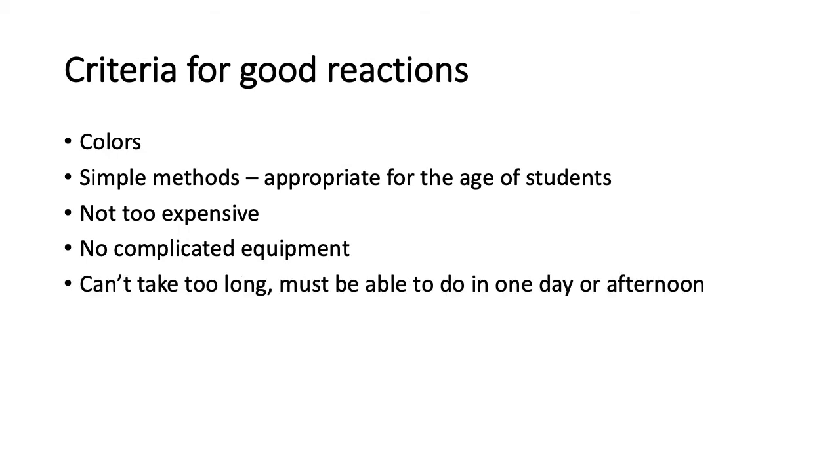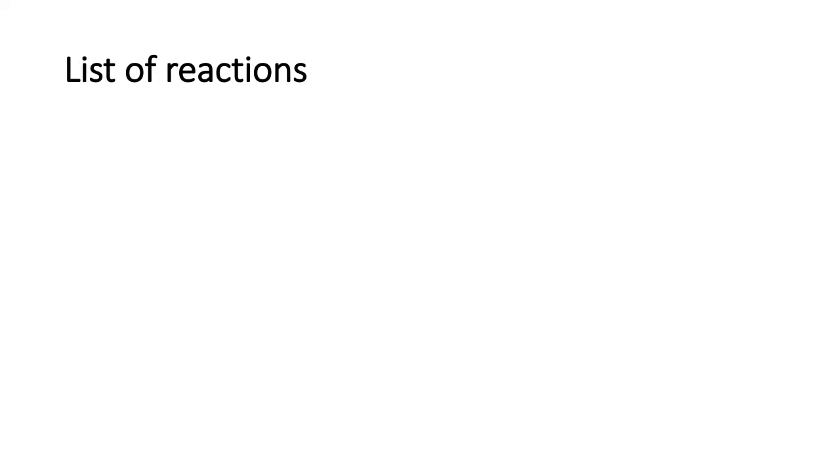They can't take too long. There's certain time restrictions, so they have to be able to be done in an afternoon or at most a day. And the chemistry has to be simple but interesting. So these are the reactions that I'm going to be doing, covering this presentation.